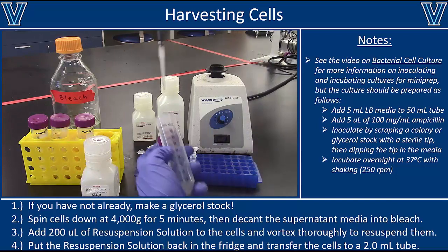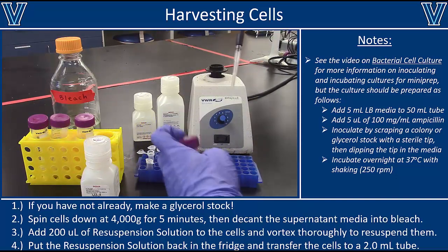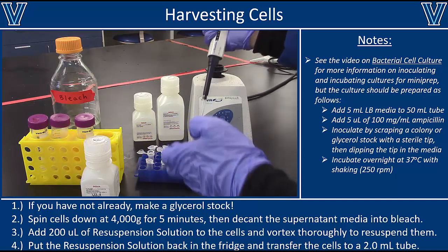All right, so once we have those cells resuspended, the next thing we're going to do is transfer them to a 2.0 ml tube.